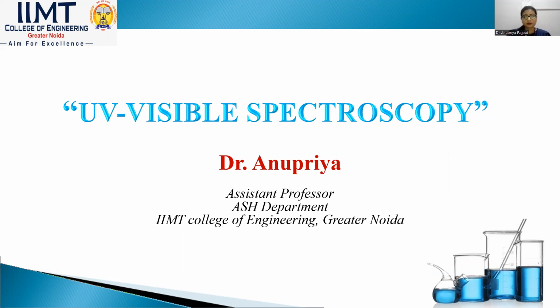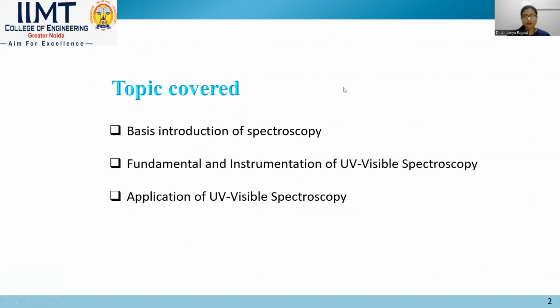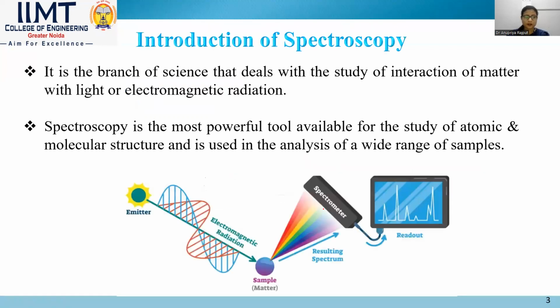In this lecture, our discussion will be on UV visible spectroscopy, and the topic we are going to cover is the basic introduction of spectroscopy, the fundamentals and instrumentation of UV visible spectroscopy, and the applications of UV visible spectroscopy.